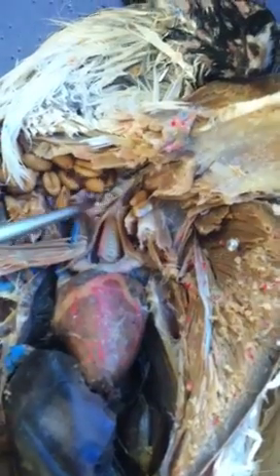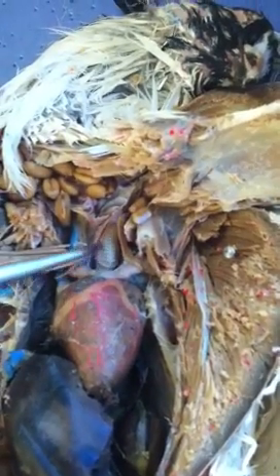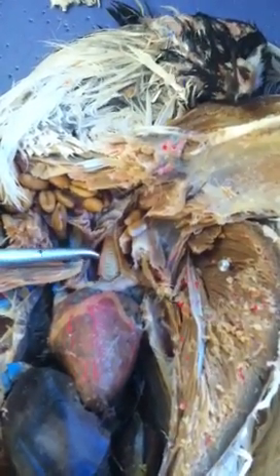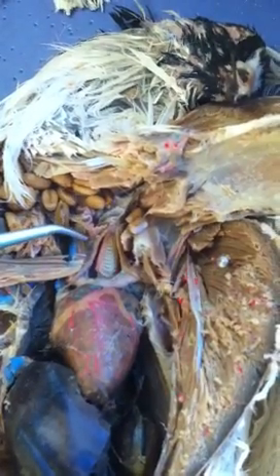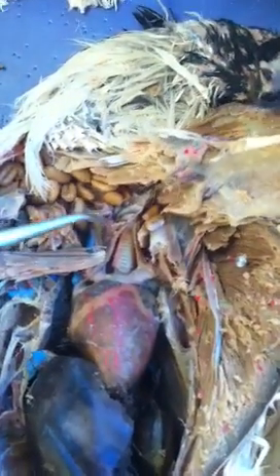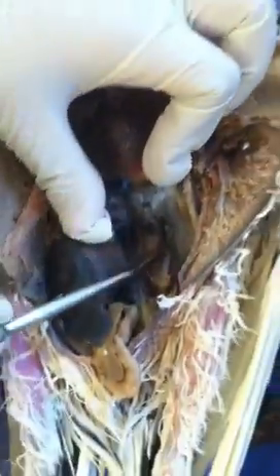Here you will see a cartilage structure with rings on it — that's the trachea. Don't confuse trachea with esophagus. Let's go along the esophagus all the way to the abdominal region.